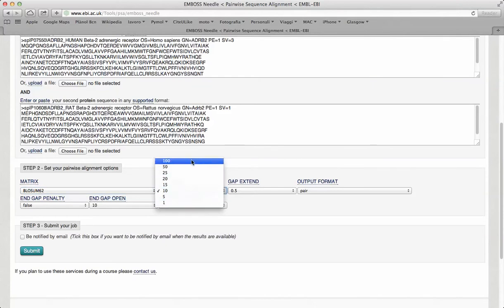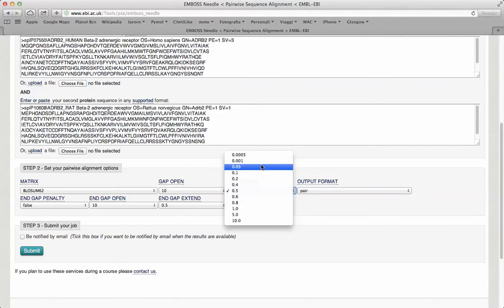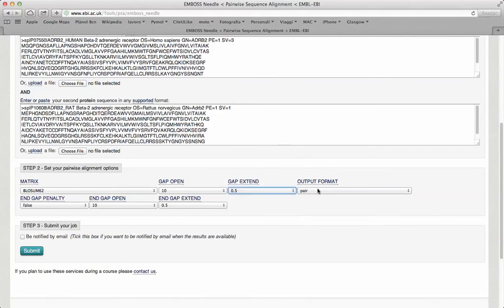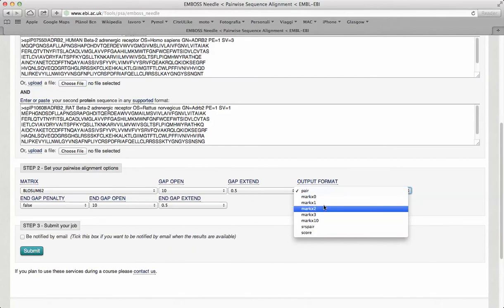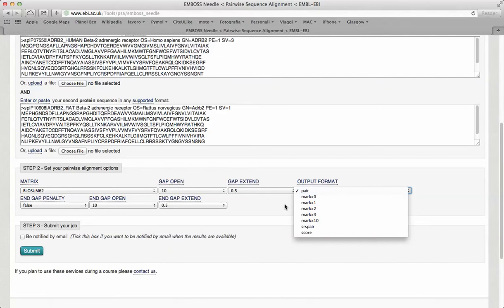The selection of gap open and gap extension penalties, and the possibility of selecting an output format for the alignment.